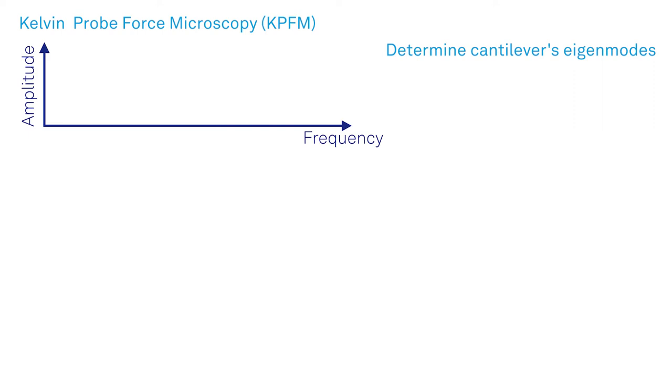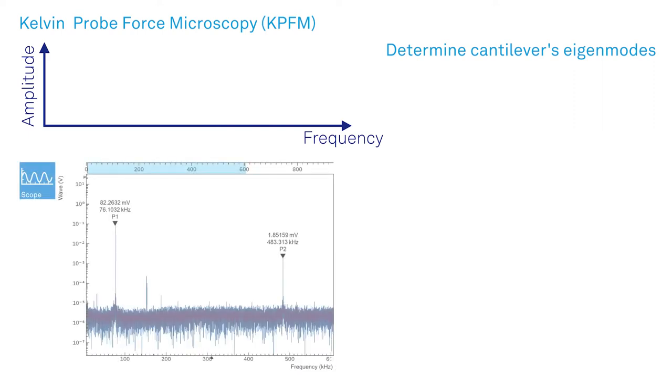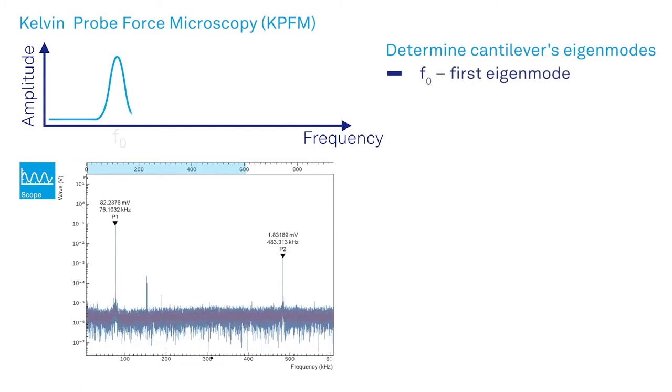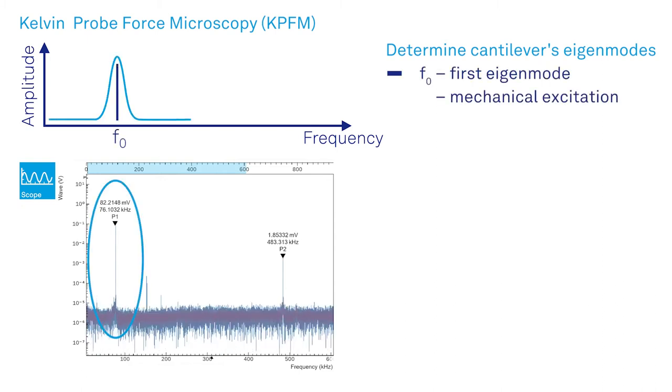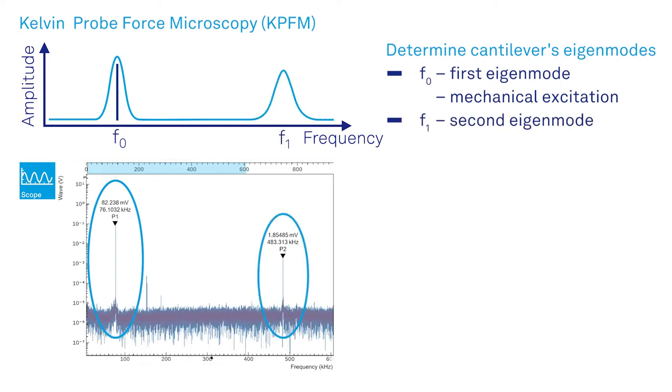We start to determine the cantilever's eigenmodes by monitoring the deflection signal in the frequency domain with the oscilloscope tool. The first eigenmode, F0, corresponds to the mechanical excitation from the AFM controller. Here we also see the second eigenmode of the cantilever, F1.